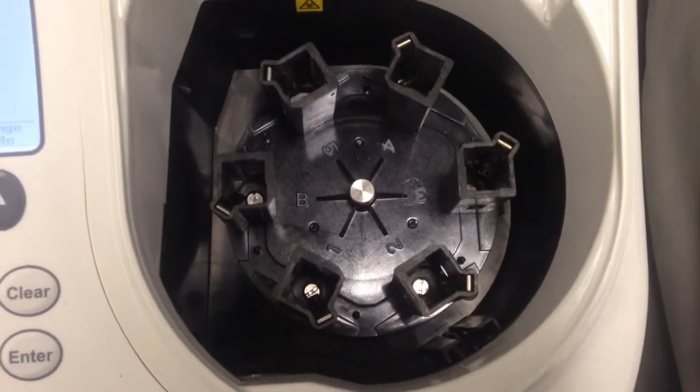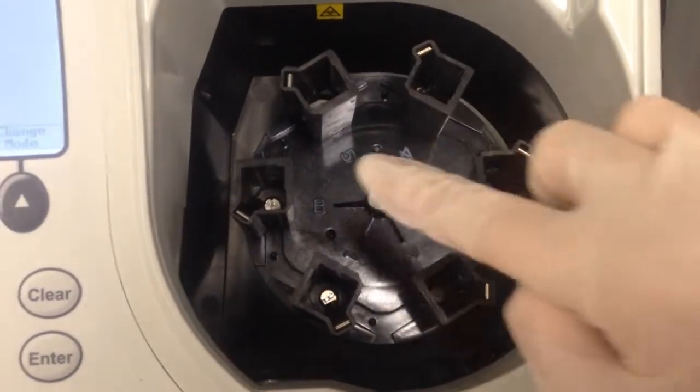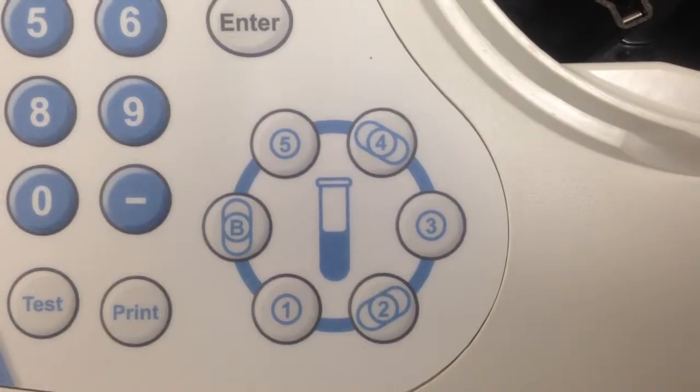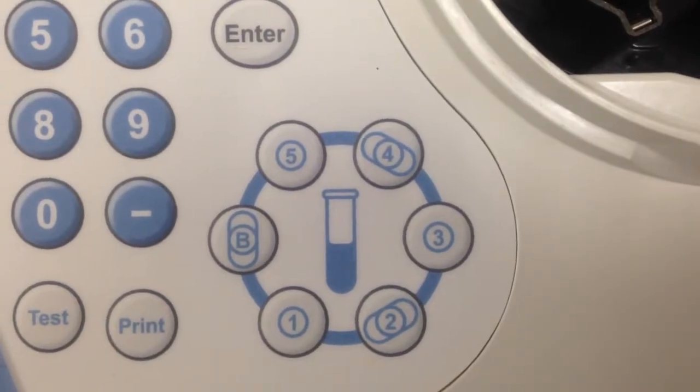Each slot is conveniently labeled, starting with B for blank. To access the slots, press the appropriately labeled buttons.